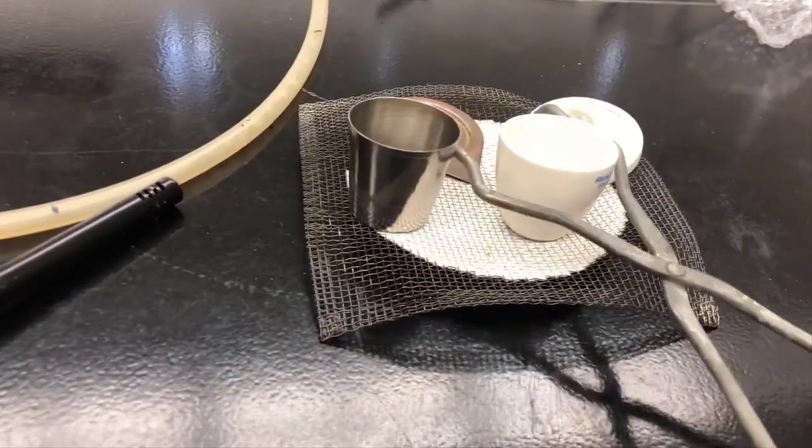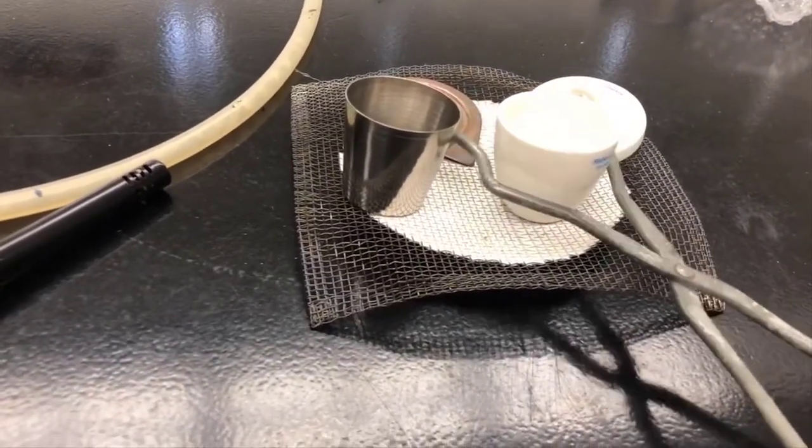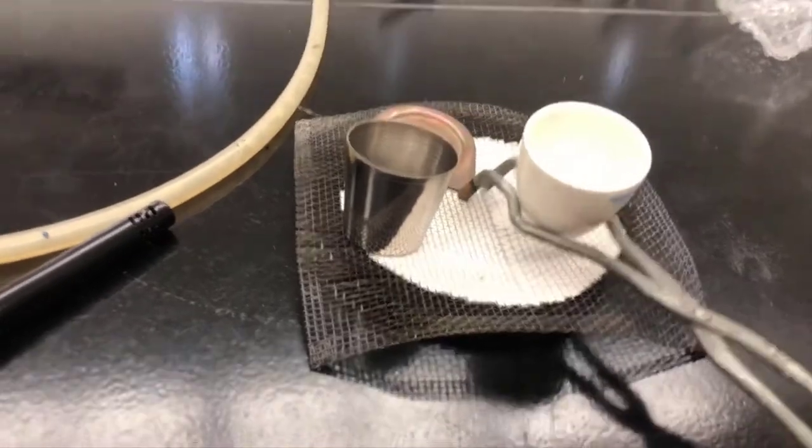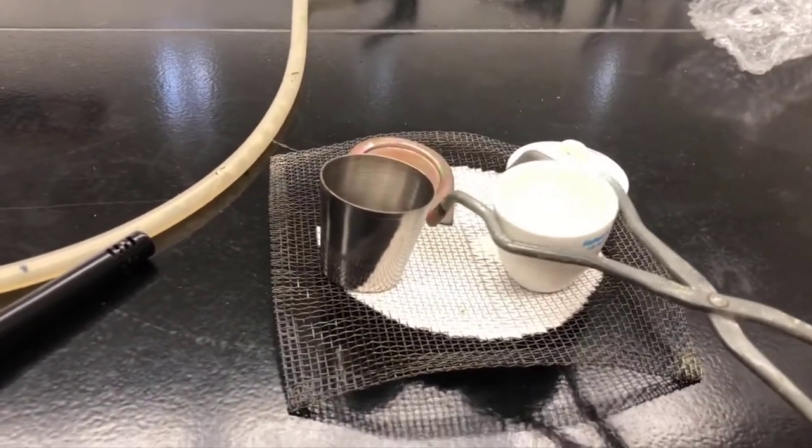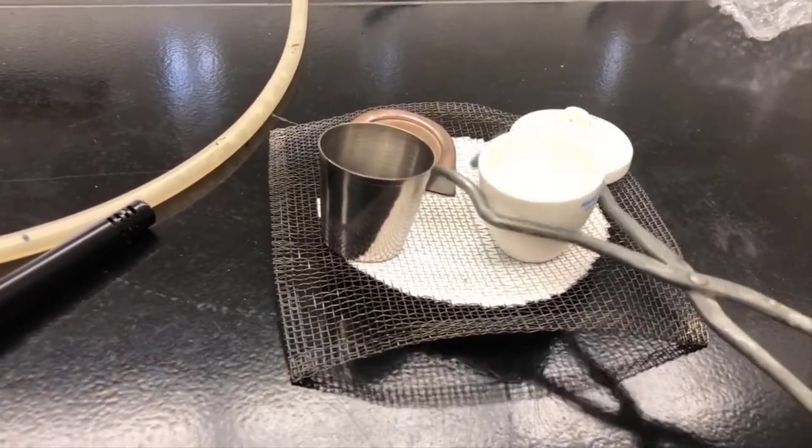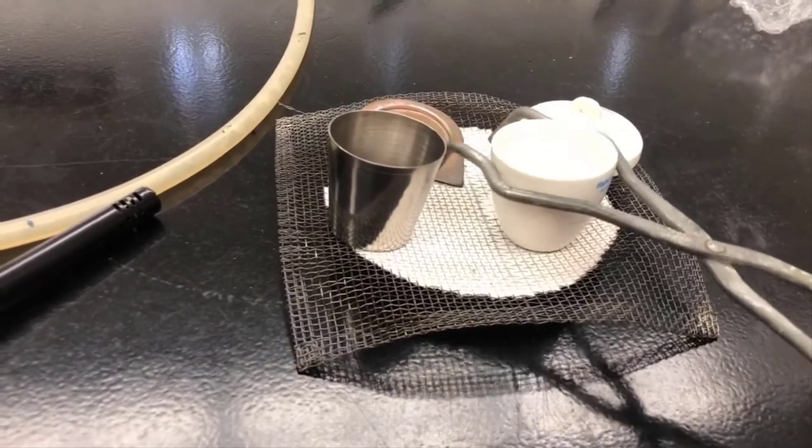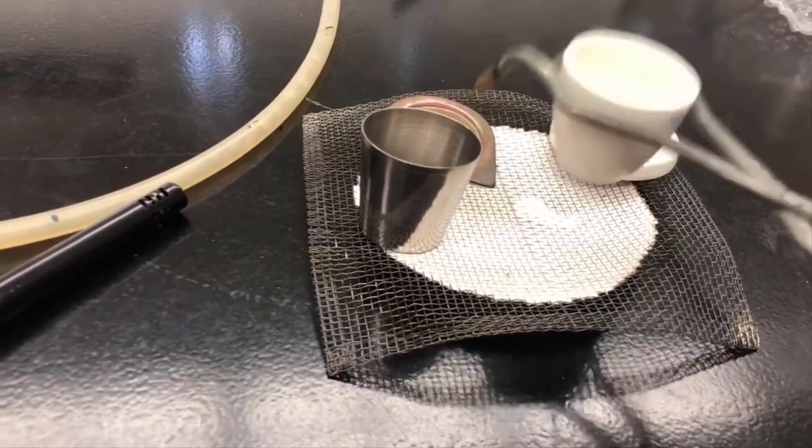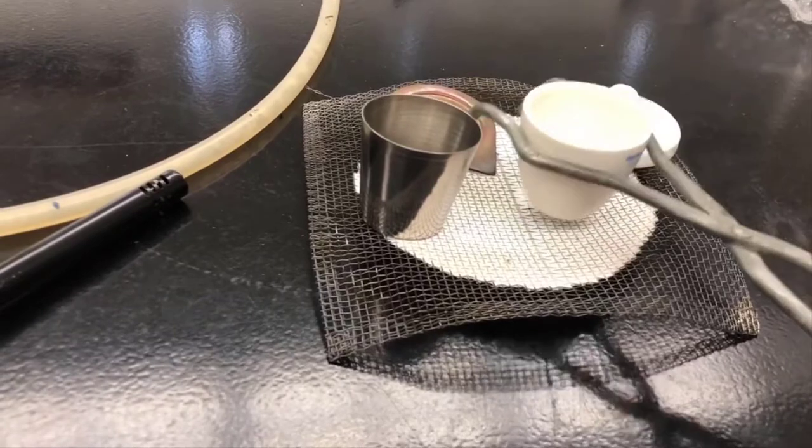But typically people grab the crucibles at the top this way. Don't try to grab it too far at the bottom because it's very slippery as you squeeze it, because the angle is too severe. But at the top, you should be able to grab it and have pretty good stability without it falling off.